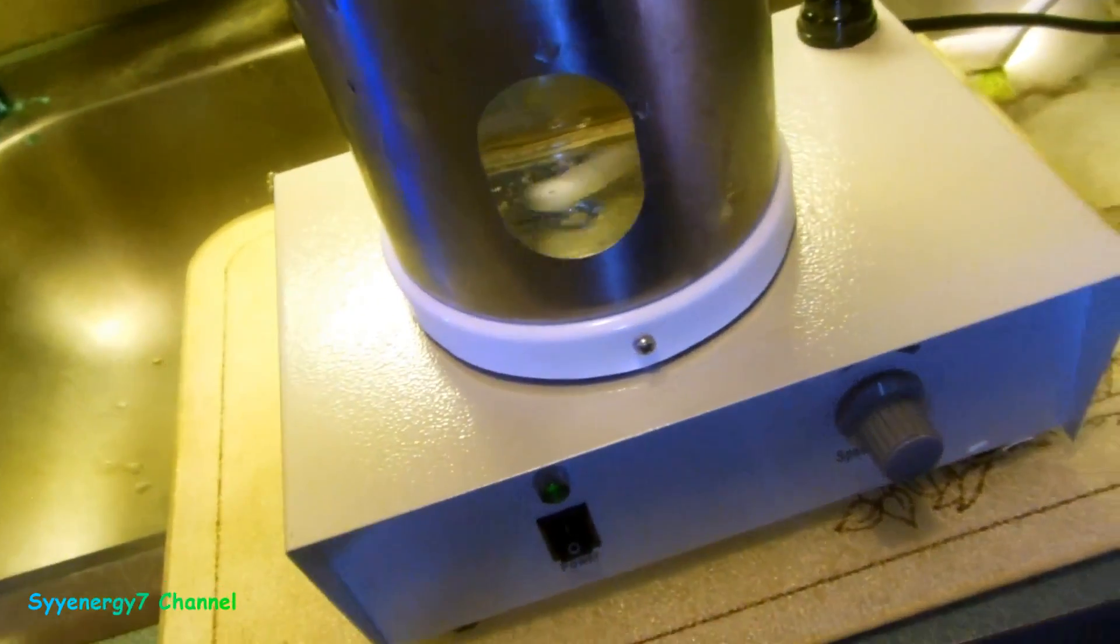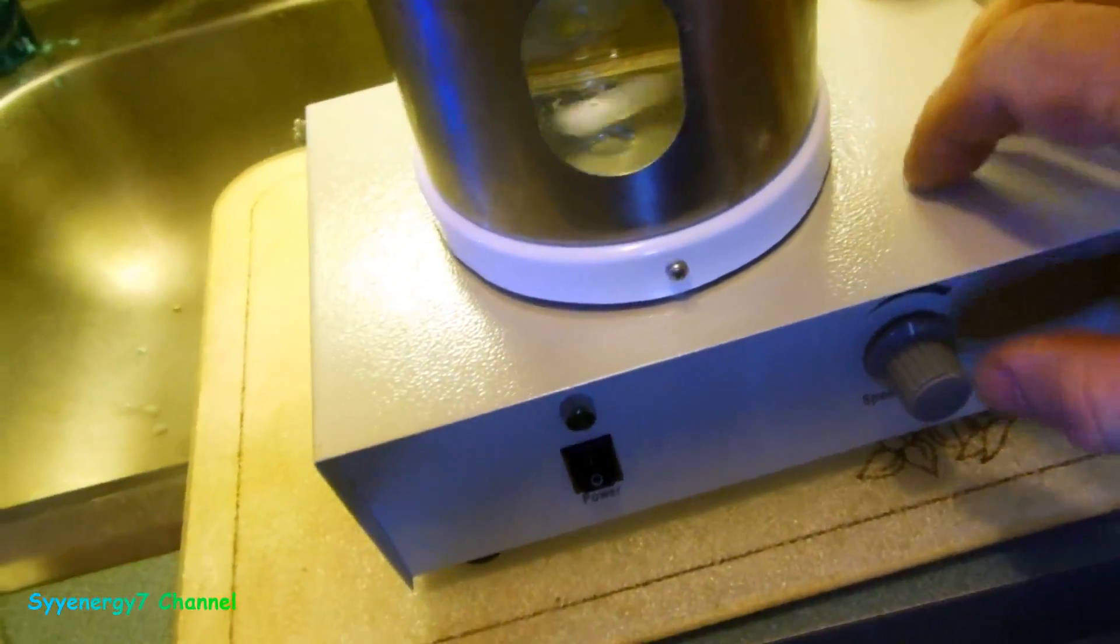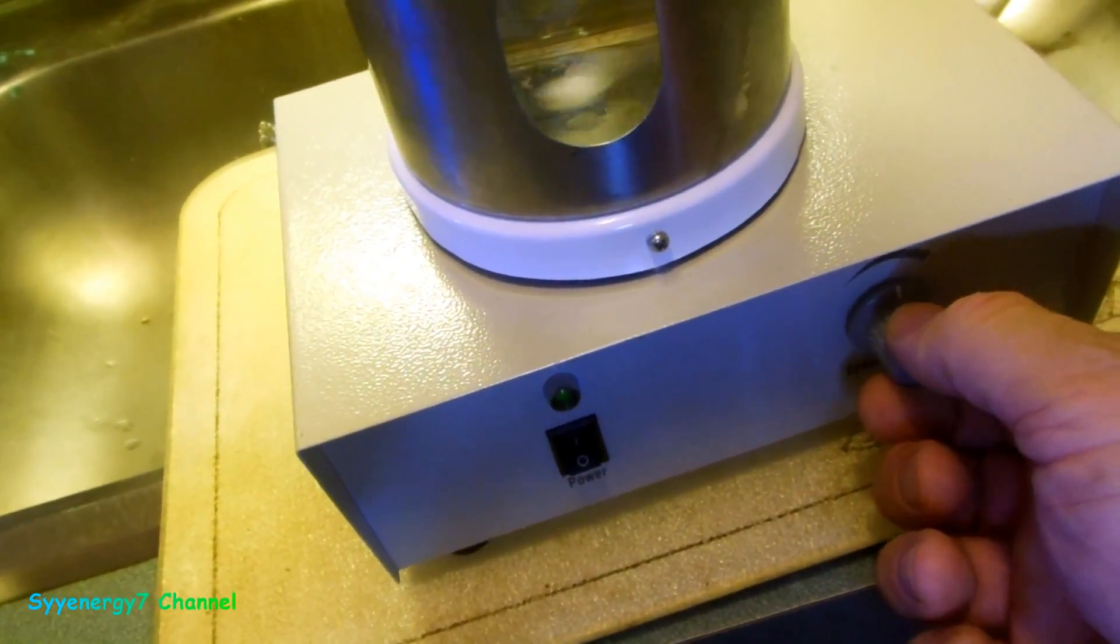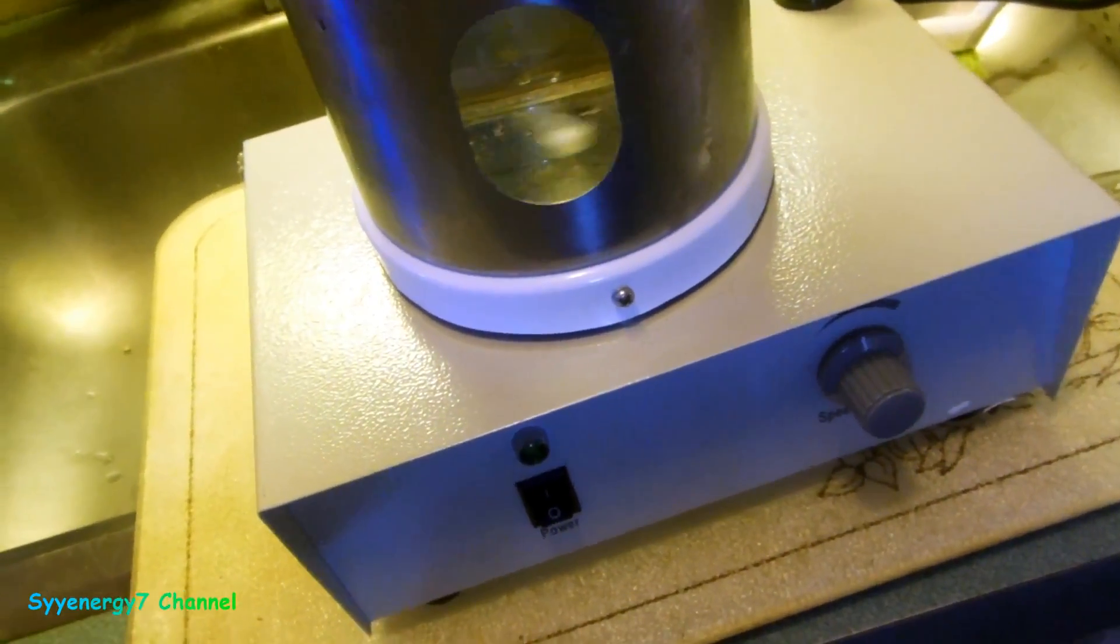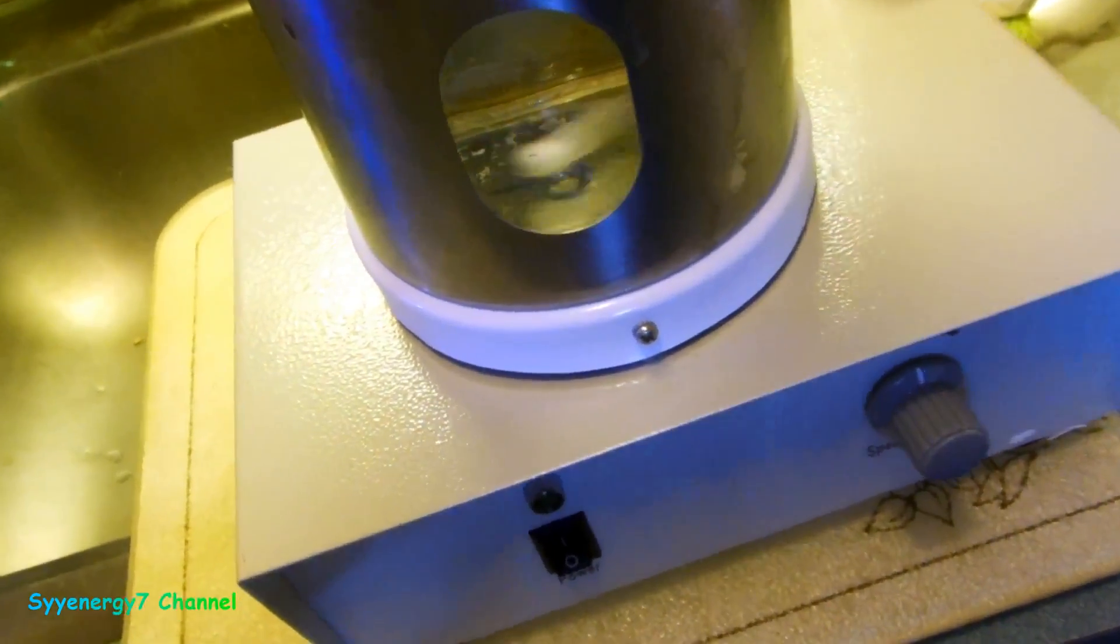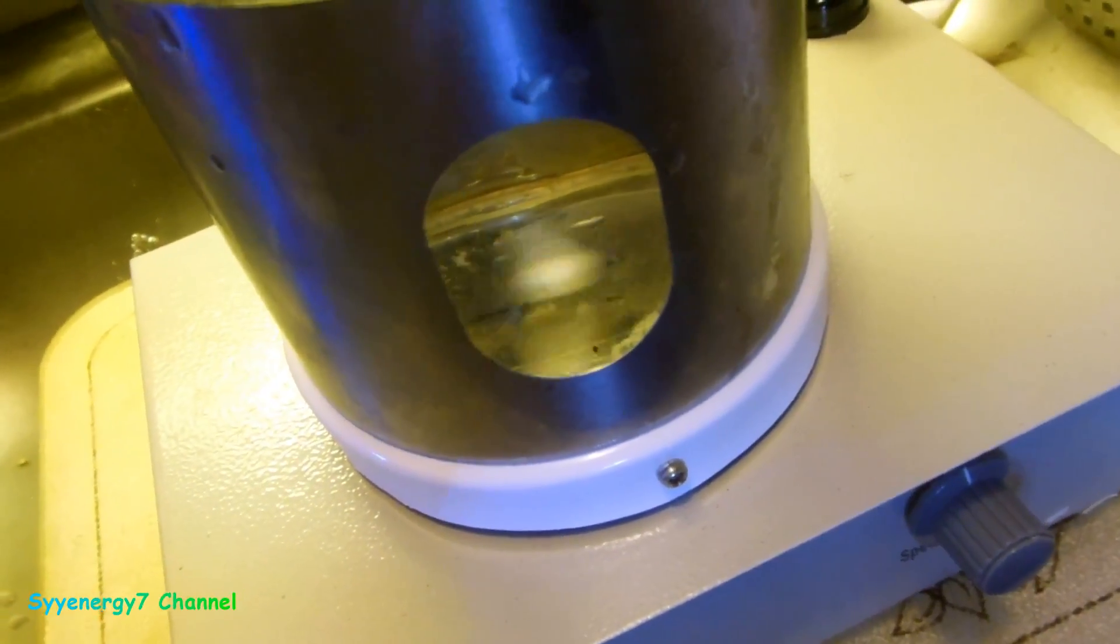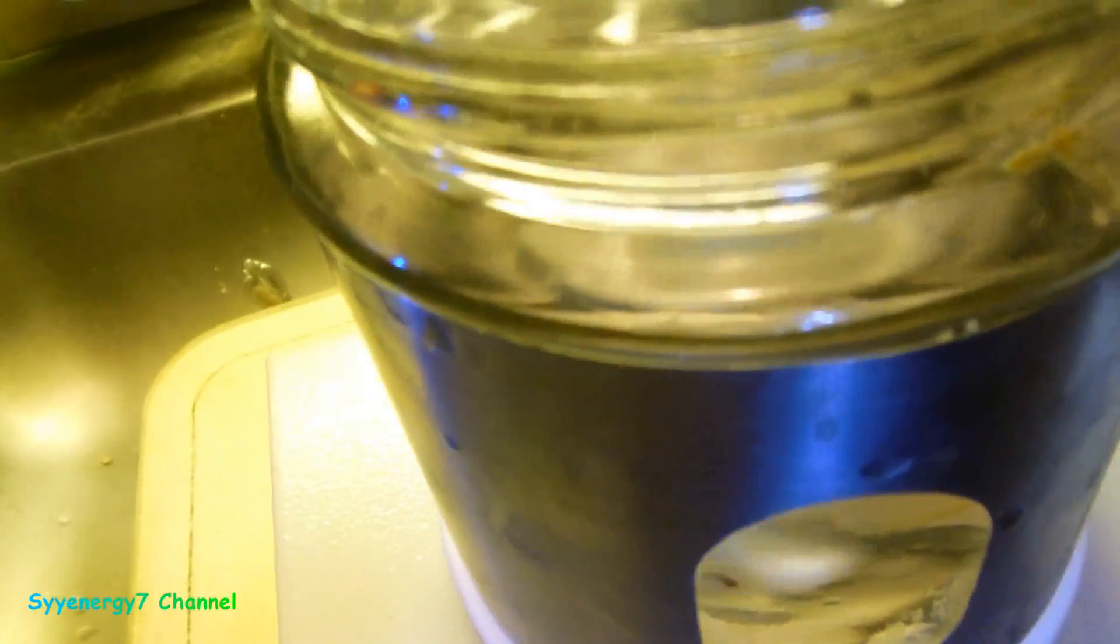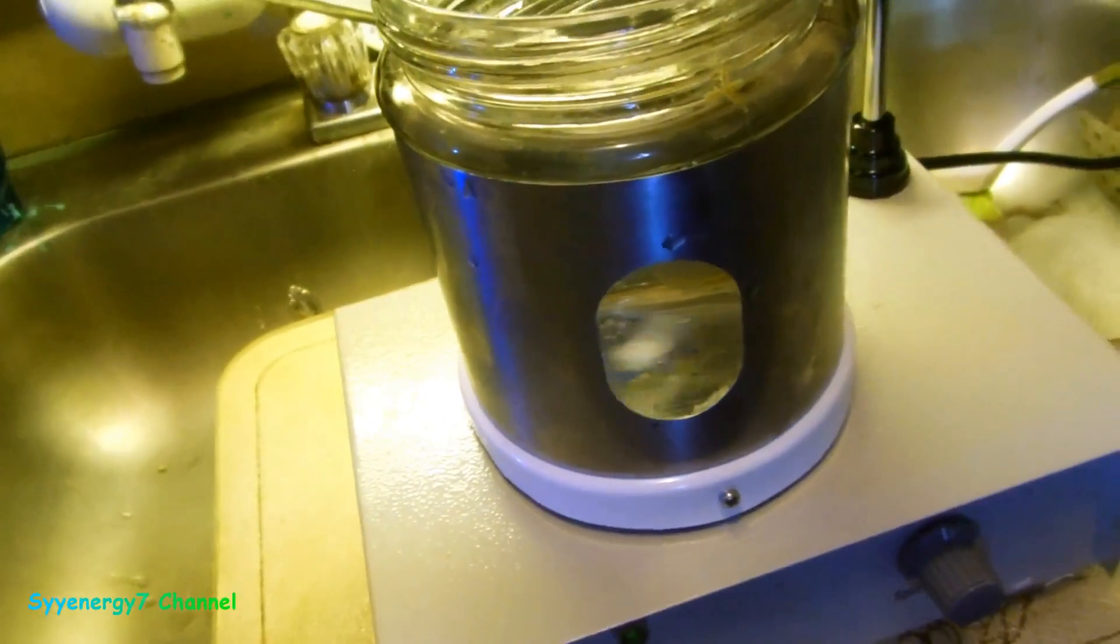But it's got a nice metal case on it, adjustable speed control. And I guess I could have made one because I have the on-off switch, I have the potentiometers, I have the big project box, I have brand new case fans for the computers which have a magnet in the back, and the only thing I would have had to buy was that. But by the time I do all that shit, I could have just had this and been done with it.